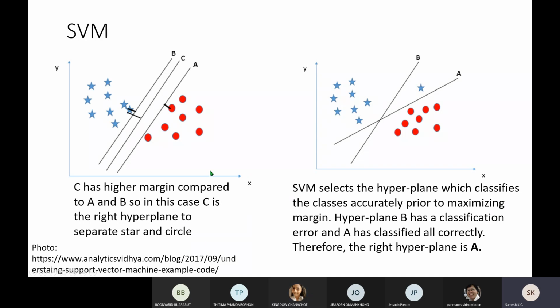You remember last time when we had a question from Ajahn Kung about what happens if a sample comes around here? Can you see? Yes. So the answer for that one is that it is an outlier. You understand my point? Yes. Okay.